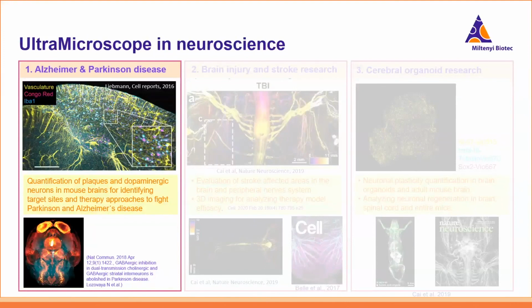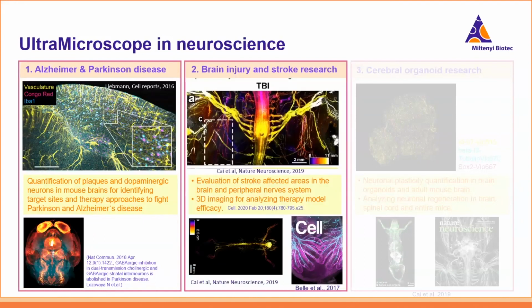This workflow could play a key role also in revealing neuronal connectivity in whole mouse and help identify the effect of central nervous system trauma on the peripheral nervous system. The work summarized in the middle by Dr. Ali Erturk shows the damage that was induced in the brain, how it resulted in an effect observed and measured in the thorax, in the dotted square you see in the middle. This highlights the importance of the holistic approach of the UM that can be crucial for therapy evaluation.